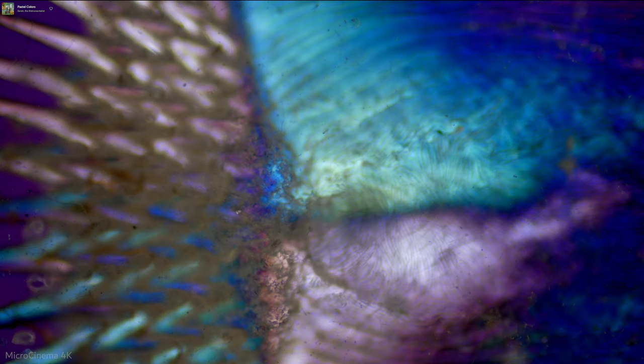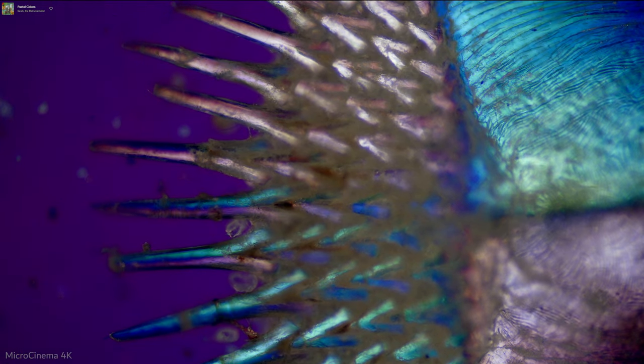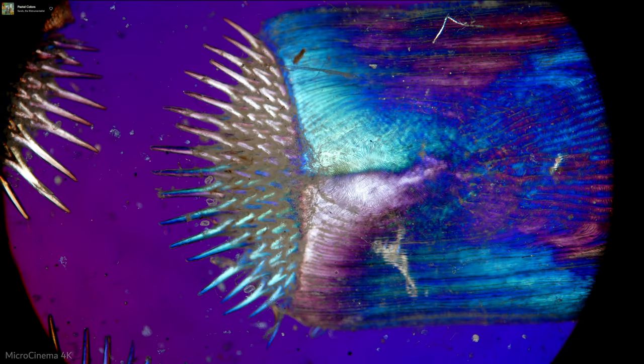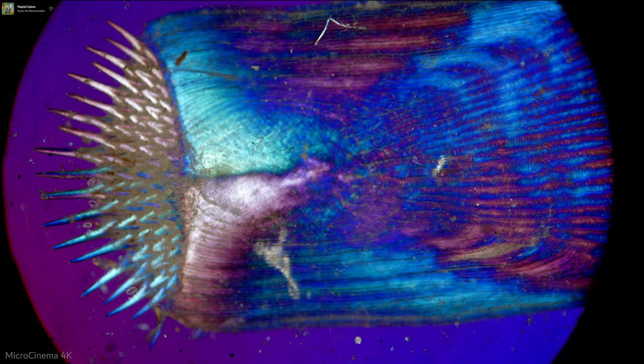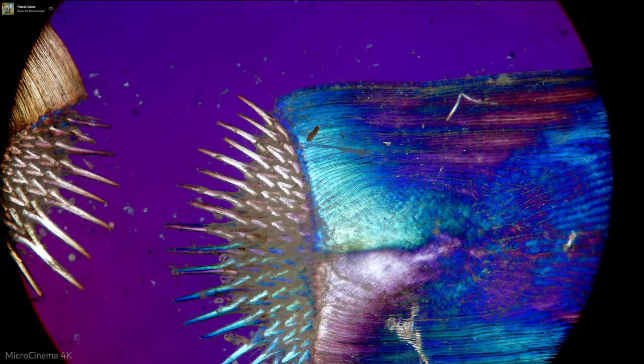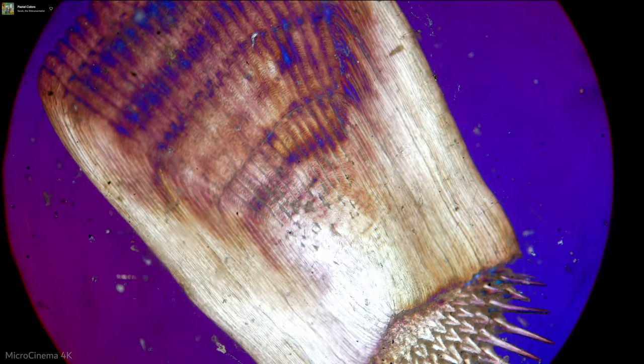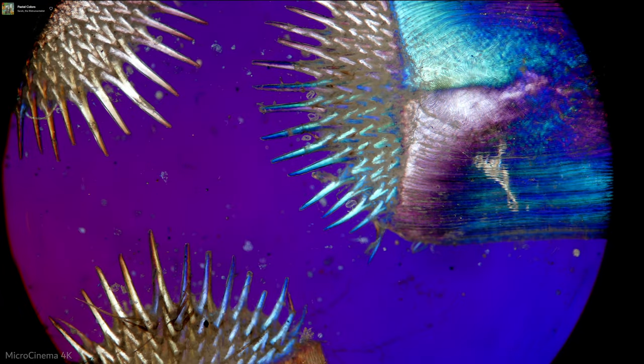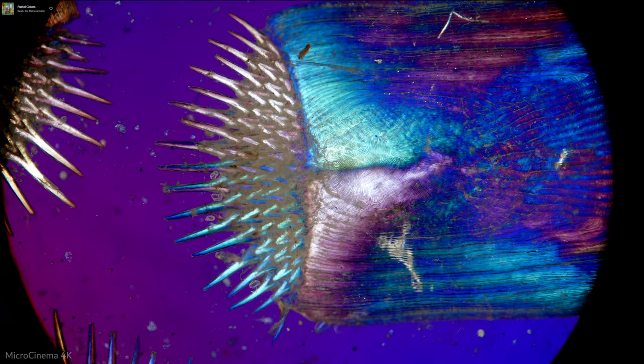This is with the 10x here, and just look at those little ridges, those maze-like ridges on them. These are super far out. I actually have a few of these scales, but this is the only one where there's three of them on the same slide. So yeah, that's my little fish scales there.